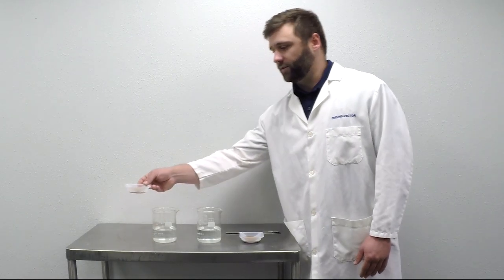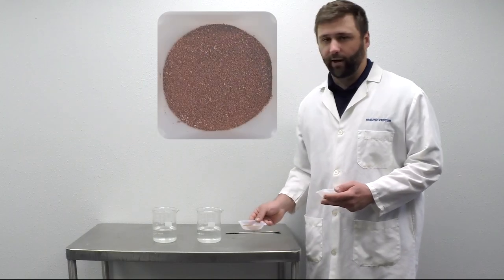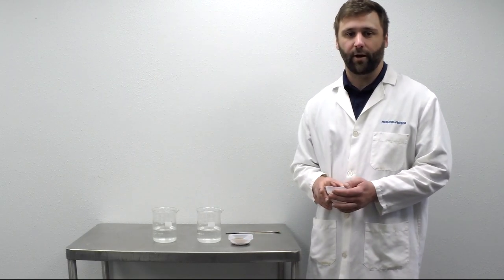So you can see here we've got just an original store product off the shelf and we've got our instantized product that we've only granulated with water. We haven't changed the formulation at all.